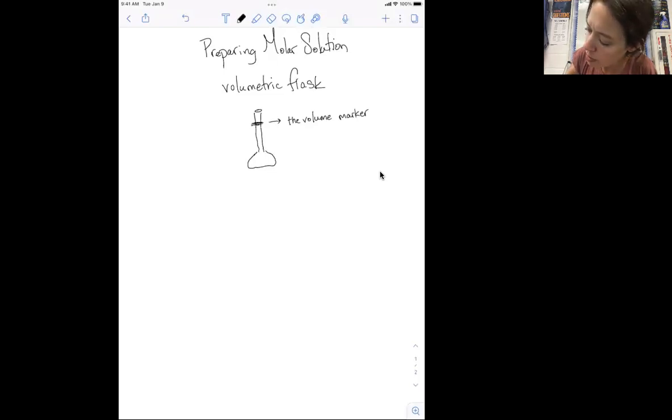Now, the way you make the solution depends on whether you have a solid solute or a liquid solute.